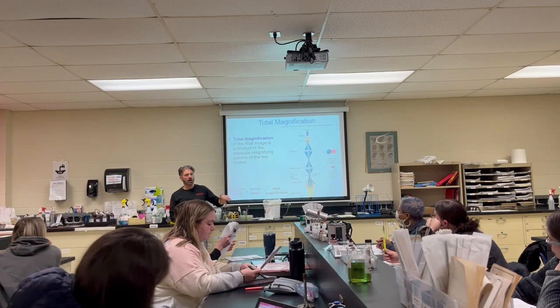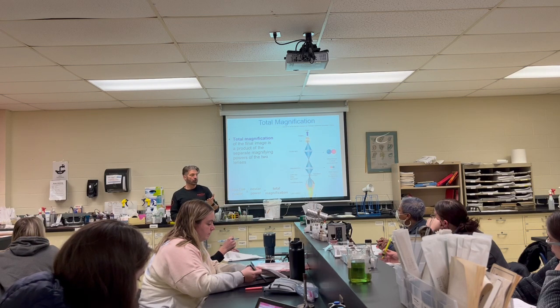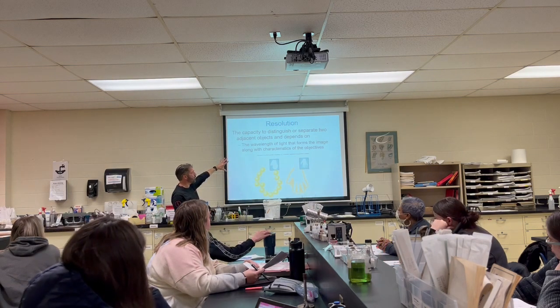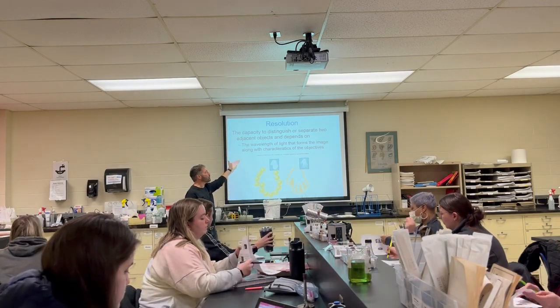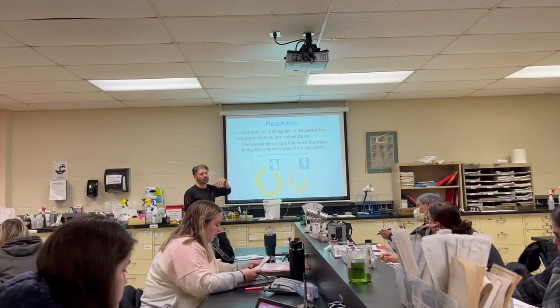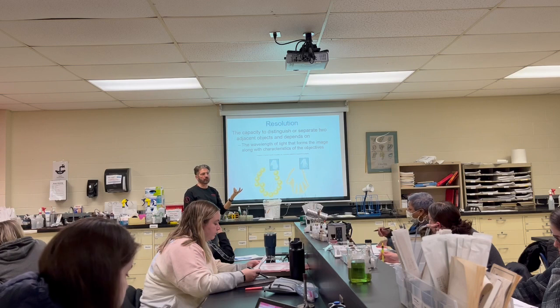You go into your high and dry, 4x, 40x, or 10x, 40x, and 100x. We'll do it in that order. Right, so this is basically just showing you your resolution. If they ever ask you, resolution or resolving power is the most important thing. Like I said, you can magnify something as much as you want. If you can't resolve and find the detail, it's pointless.